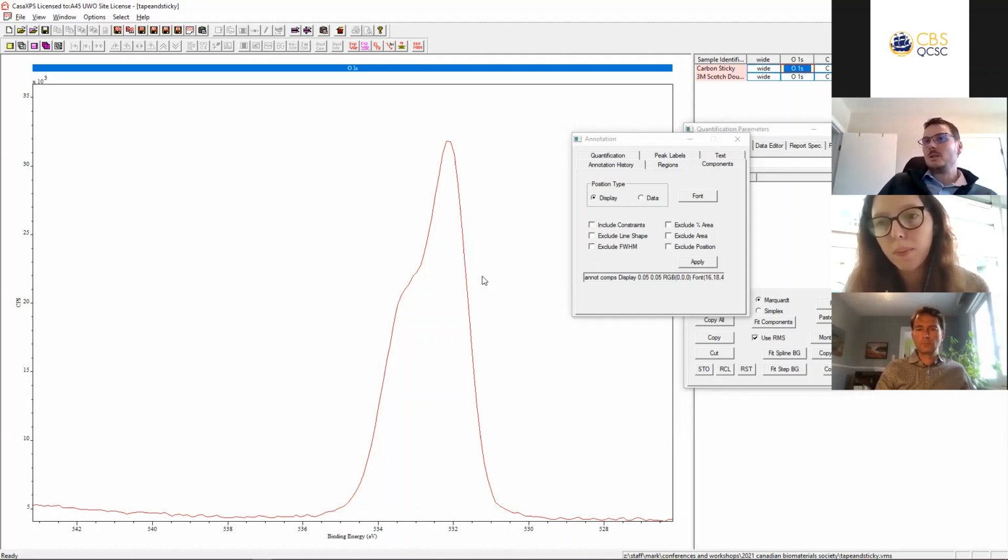If you look at standard materials, you can tell that if I have a metal oxide, generally the full width half maxes for them will be between 0.8 and 1.2 eV in the O 1s. If I have a hydroxide, it's generally a little thicker, like 1.5, 1.6. If I have something like sulfate, 1.8, 2. It's based on seeing lots of samples and having some of those libraries.